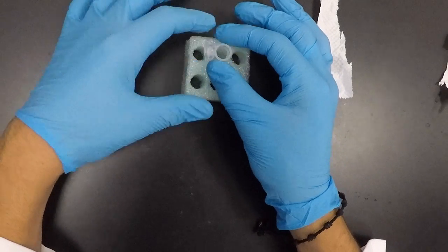The final result is a pellet of DNA of ginger.